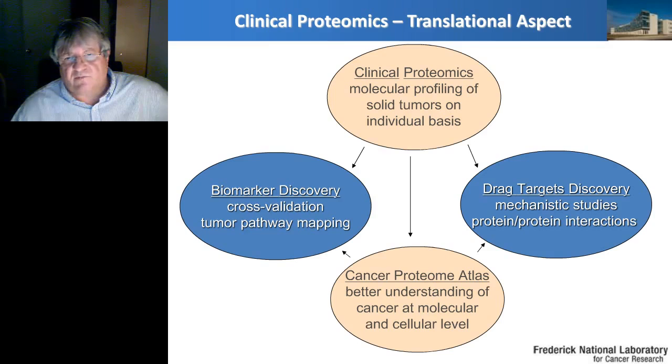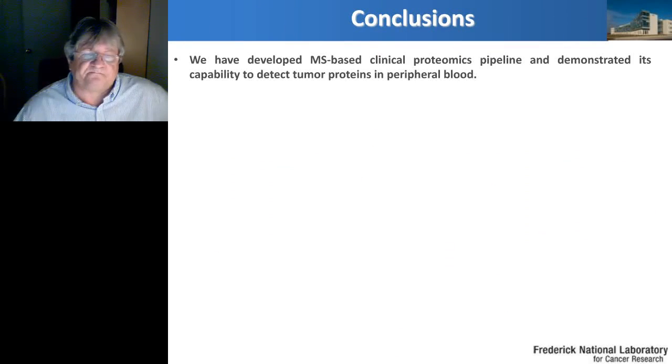And we see proteomics as a complementary part of the omics, although I think we can see the light at the end of the tunnel that proteomics may be increasingly more successful and a better tool to look at cancer biology, drug targets and novel biomarkers.